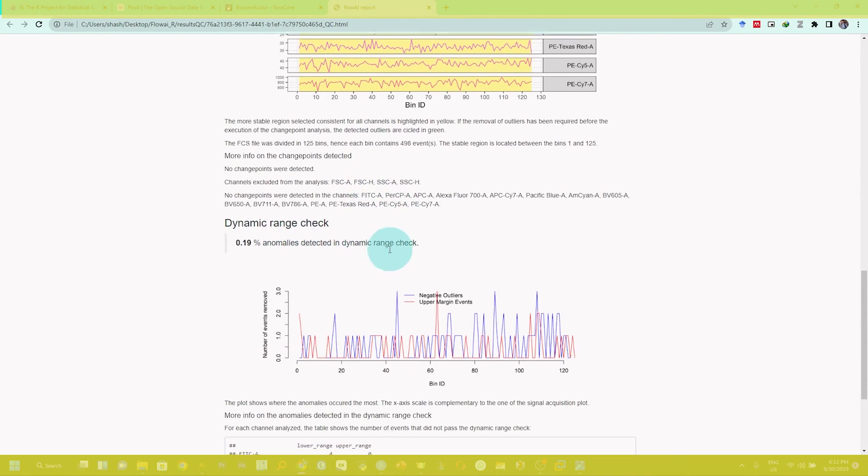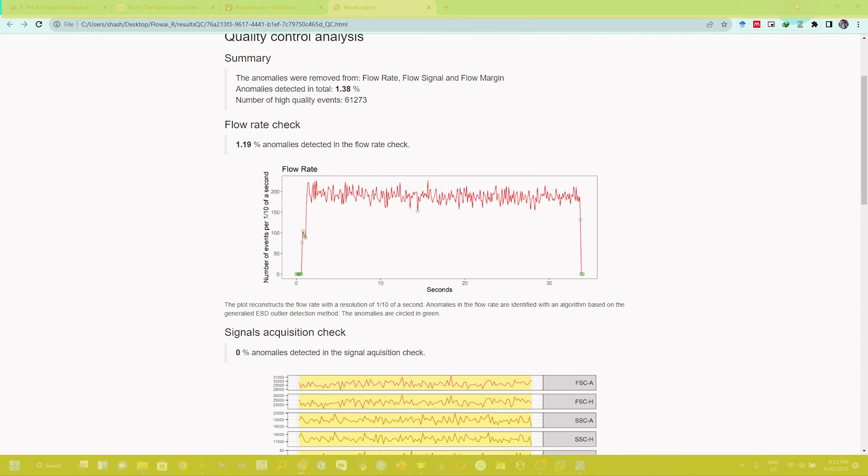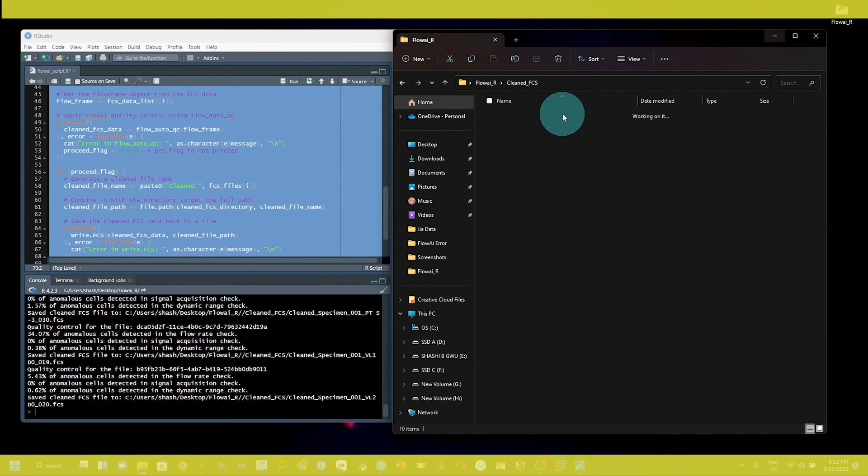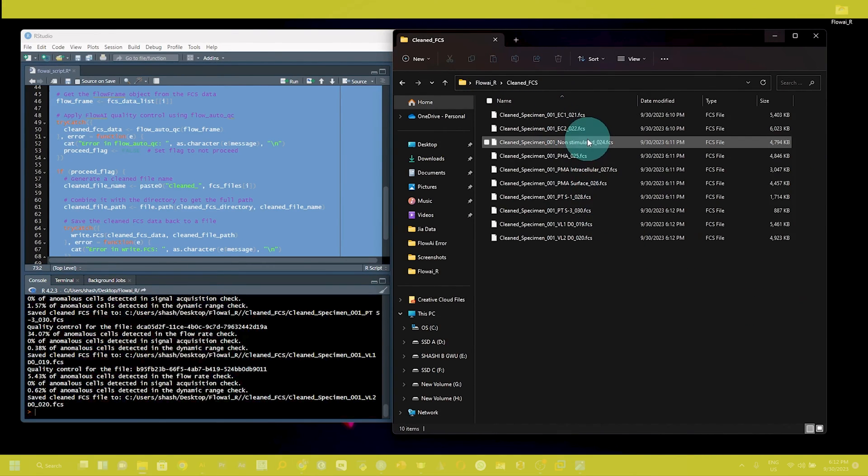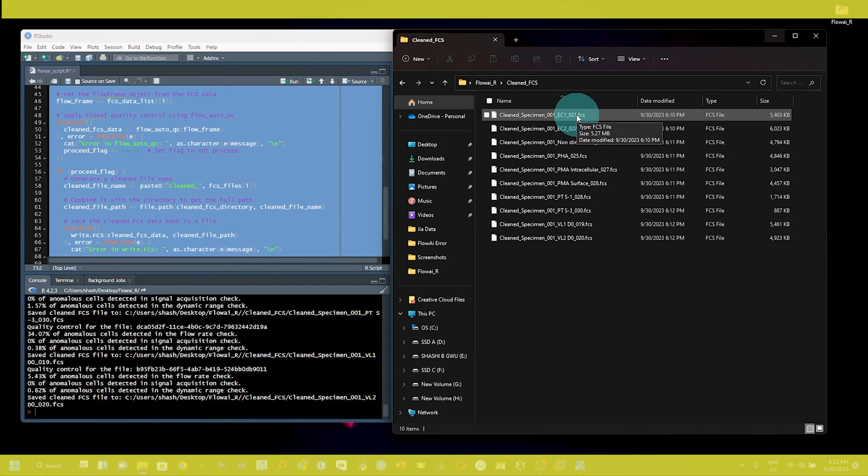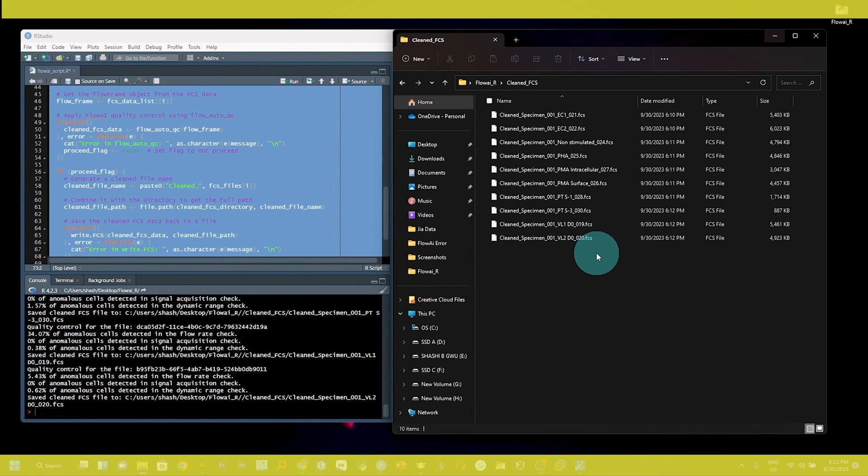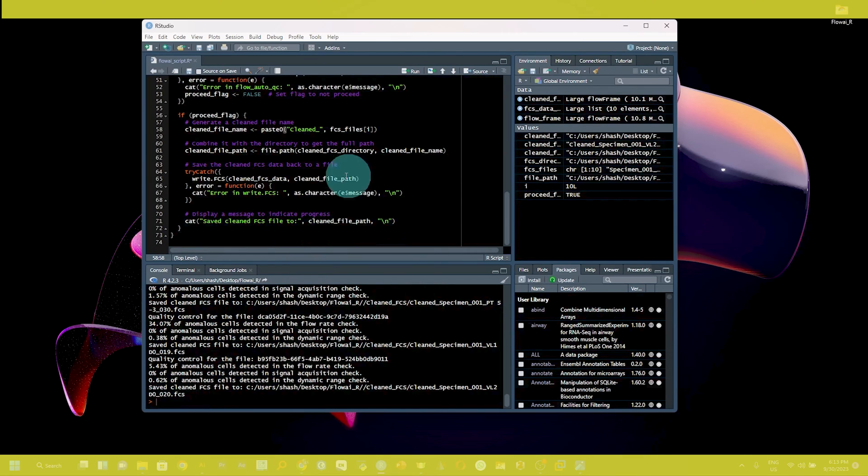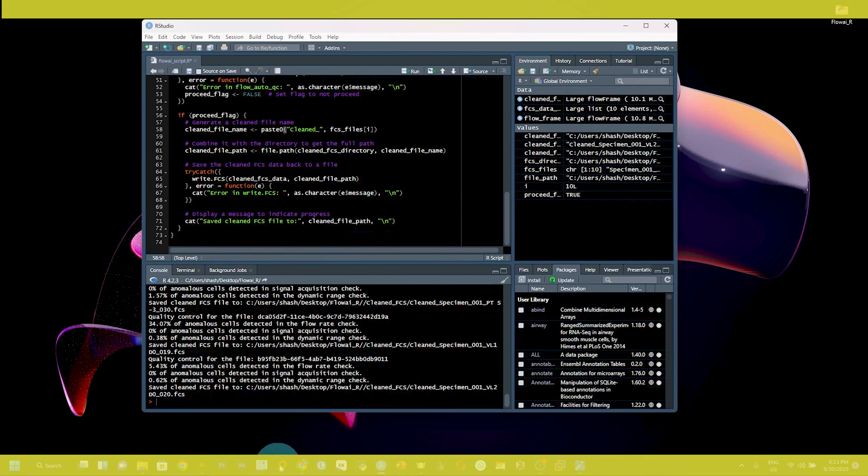Ultimately you will get the clean fcs file, and you can use this file in further data analysis. So now you can see our script run is finished.